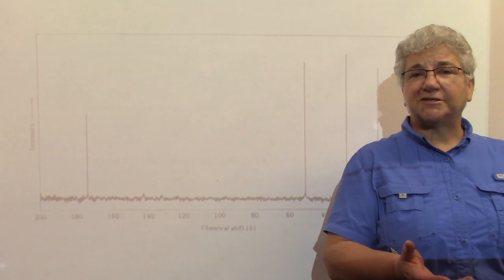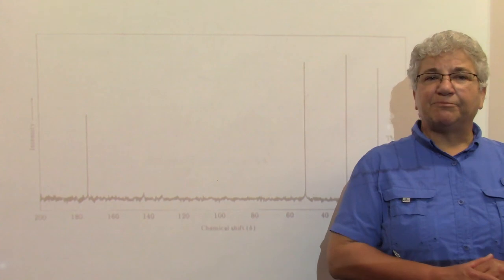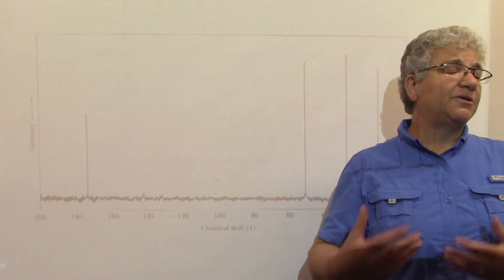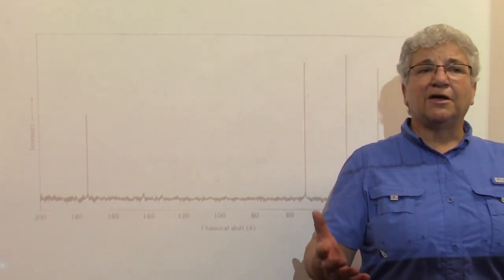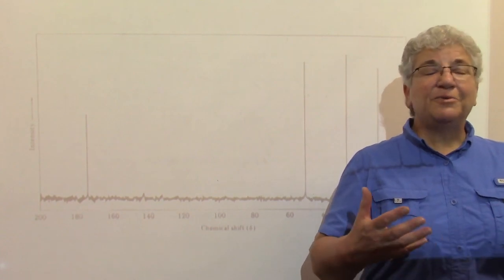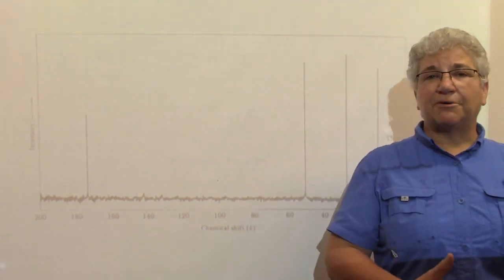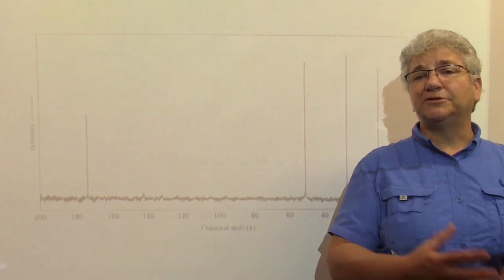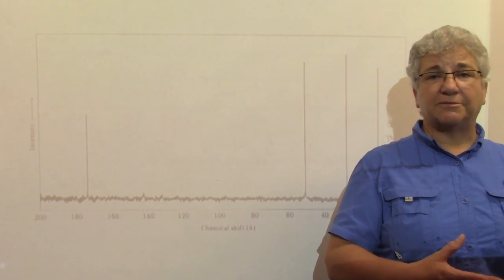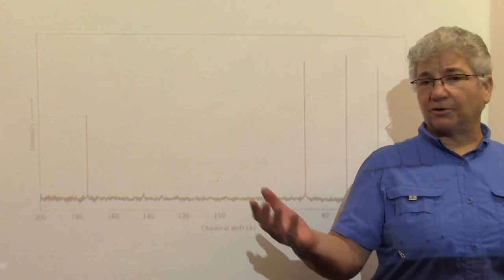If I wanted to figure out the molecular weight of my mysterious white product, then I would run something called mass spectroscopy. We'll talk a little bit about mass spectroscopy second semester, not first semester, but that we traditionally use to tell us the molecular weight. And if we know the molecular weight, then we might know approximately what the molecular formula is. But then we still don't know what the molecule looks like. And that is where C13 and proton NMR come in, and you really start to build your molecules together by interpreting the data that you get in those spectra. And so that's why organic chemists really use NMR as our go-to tool for virtually everything.